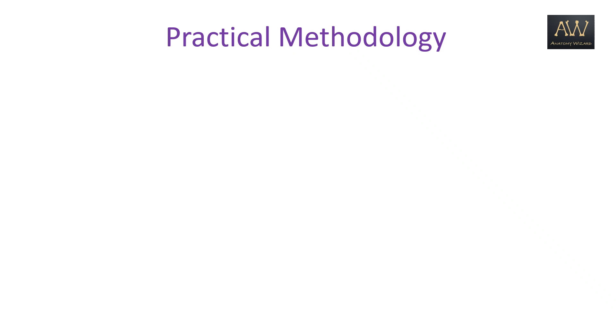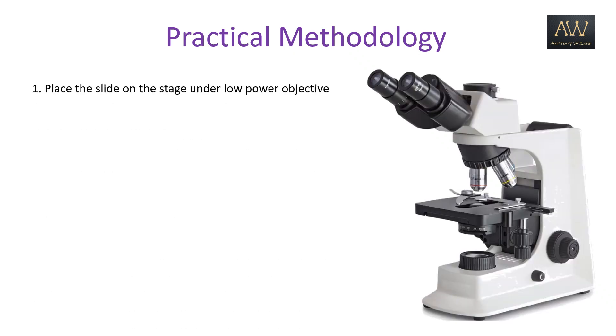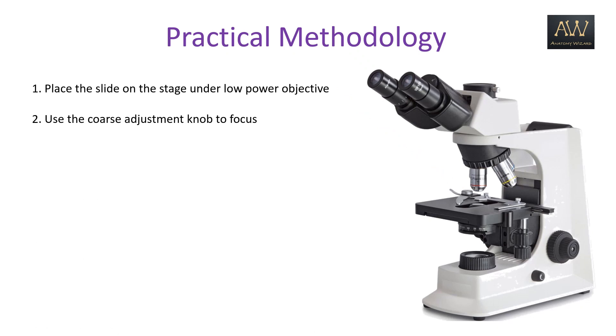Before we begin identification of various epithelial tissues, there are certain steps required to be followed to facilitate correct identification of the tissue. Firstly, place the slide on the stage under the low power objective. Then use the coarse adjustment knob to focus onto the tissue.